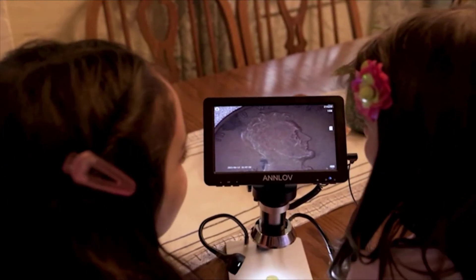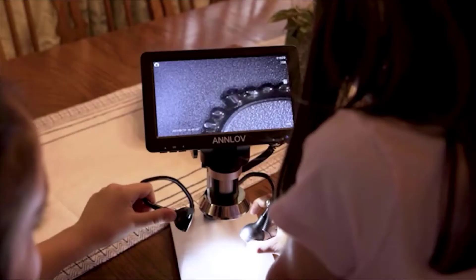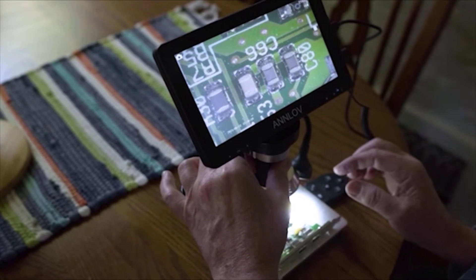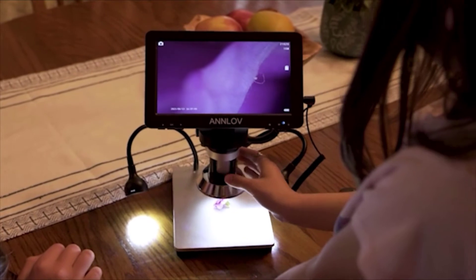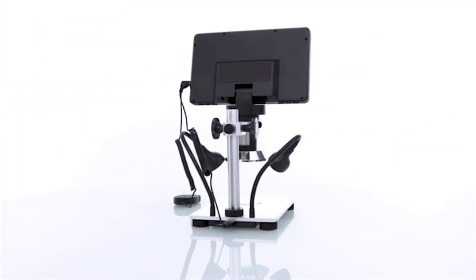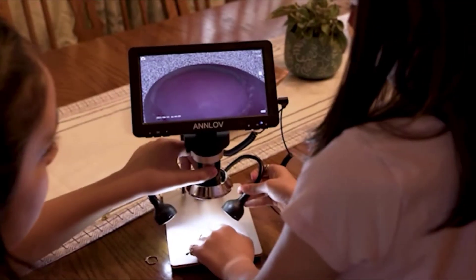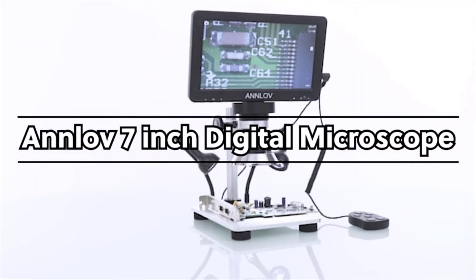Perfect for viewing coins, plants, PCB boards, jewelry, and more. The adjustable lights let you pinpoint what you want to look at and the intensity can be controlled. The adjustable screen will give you a comfortable angle to view without strain. This would make a great gift for anyone that wants to see our microscopic world, and is perfect for anyone that works in watch repair, stamps, coin collecting, or students and teachers. My granddaughters are in love with the Anlov 7-inch digital microscope.